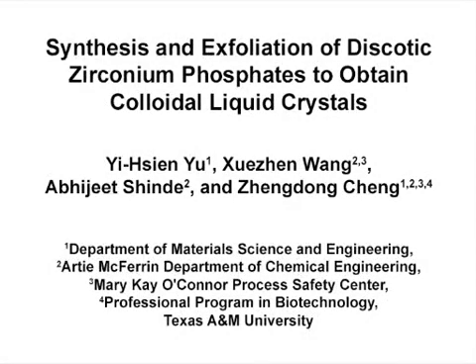The overall goal of this zirconium phosphate synthesis by 3 methods and its exfoliation is to obtain various aspect ratio nanoplatelets which can serve as a model discotic liquid crystal system.